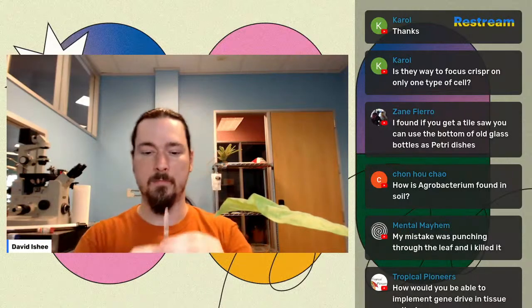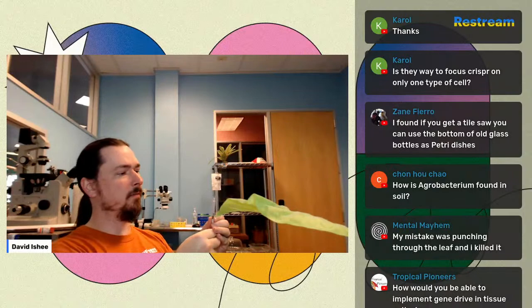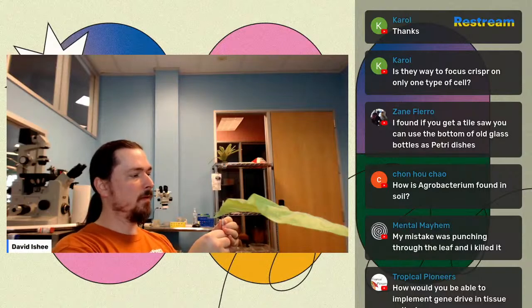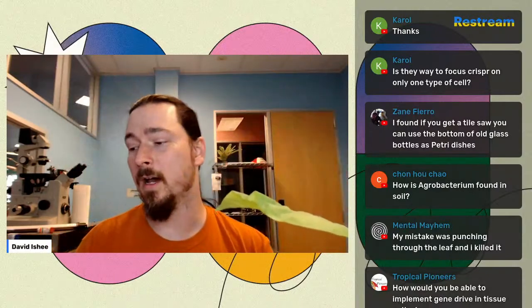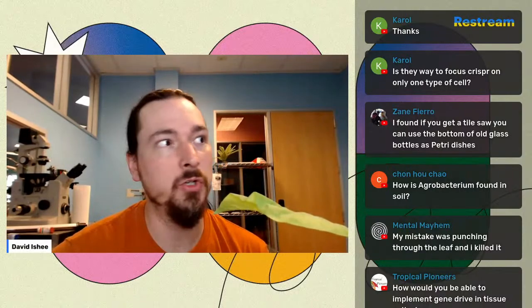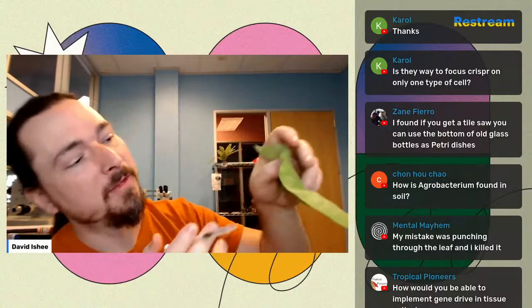Okay. So one thing, just try not to suck up any air, push the air out. If you're not really familiar with working with syringes, it just takes practice. But yeah, so the key for me, I don't know if this is a safe practice. Agrobacterium, by the way, can modify human cells. It's been done. It's not very efficient. It's not nearly as good as plants, but it's something to be aware of.